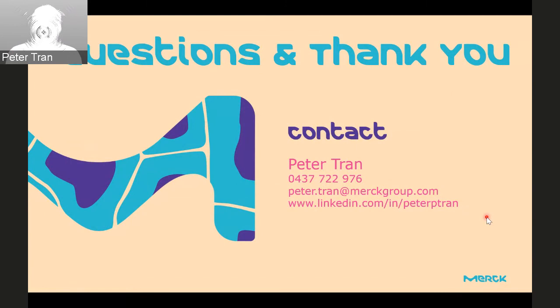But with global proteomics, I would recommend you do fractionation, right? As I showed you, you need to fractionate the sample just to divide your sample. Whether you use chromatography for fractionation or a method, for example, extracting the membrane, nuclear, or cytoplasm fraction. That's where you can increase the detectability, right? And then you can combine the results from the proteomics on each fraction. That's where you can increase the identification.